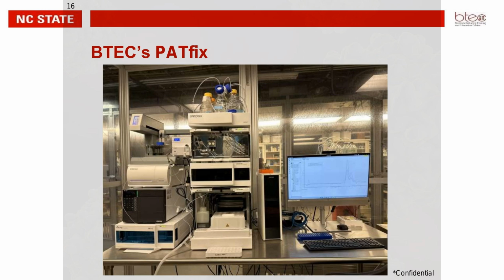One very cool feature that I like about the system is it also has pH and conductivity sensors in line, which helps us very well when we are running gradients. You don't just rely on percentage A and percentage B to assume that the gradient is running fine. You can actually see that gradient forming by the change in the conductivity and pH traces.